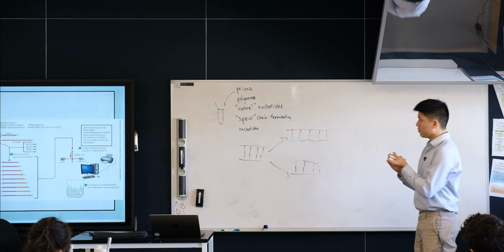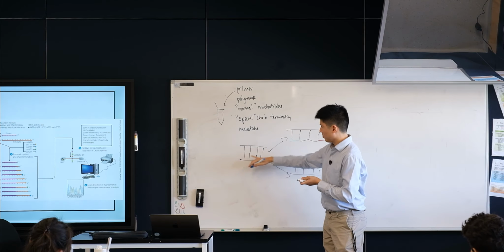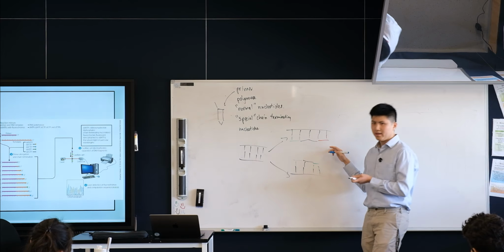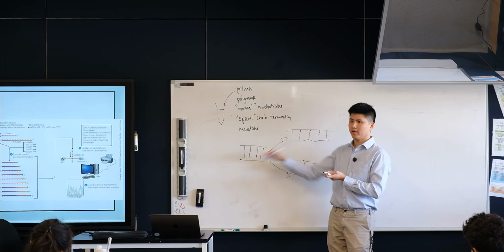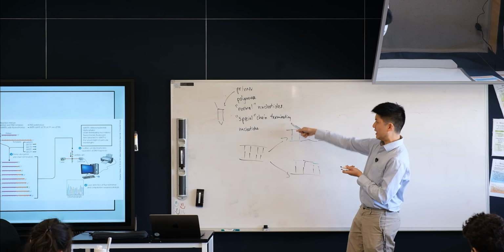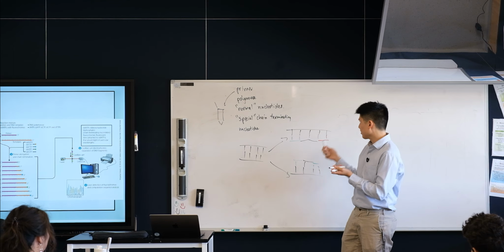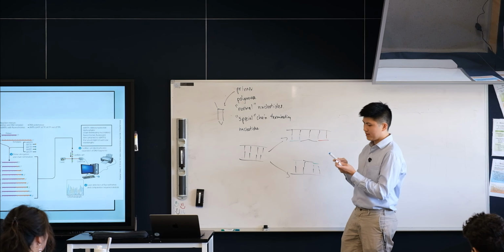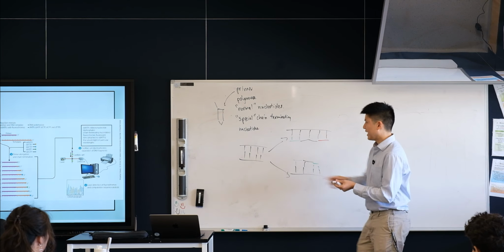So then what you'll get is, obviously, because you've stopped early, you haven't made the full length of this DNA strand. Because the chain terminating nucleotide means you just didn't get to the end, because nothing can pair after this thing attaches. So you have to repeat the process because you have to keep trying.